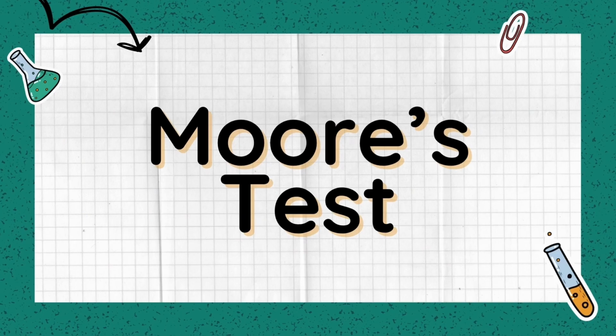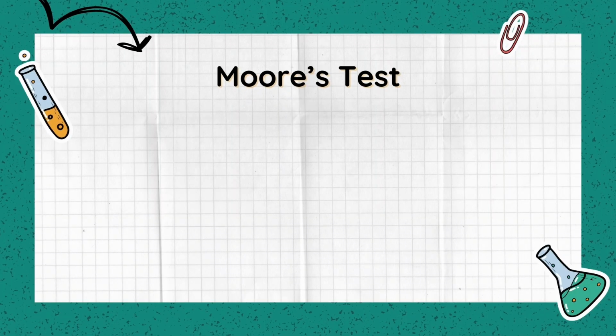Moving on, we have the Moore's test. It's a pretty funny name, isn't it? But what is it really? Well, it's actually pretty simple. The Moore's test is commonly known as the test for reducing sugars. Well, what are reducing sugars? Well, we have glucose, fructose, and the likes of which I'm sure many of us are familiar with.